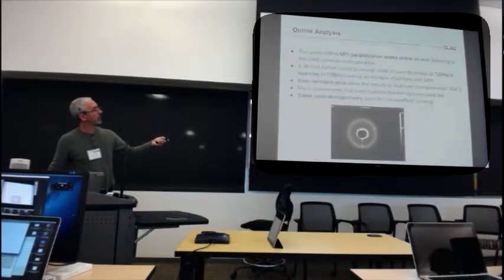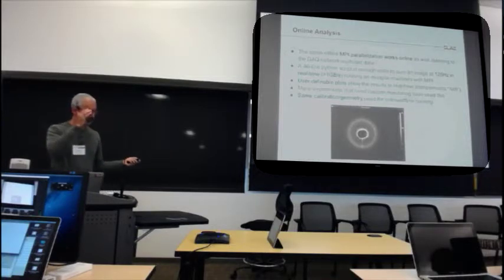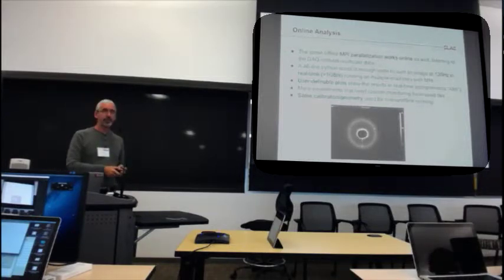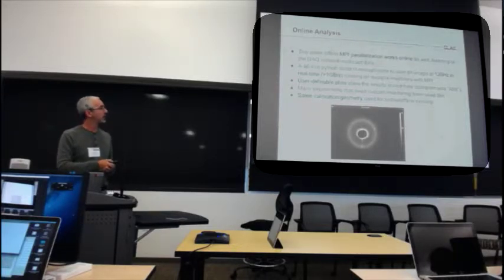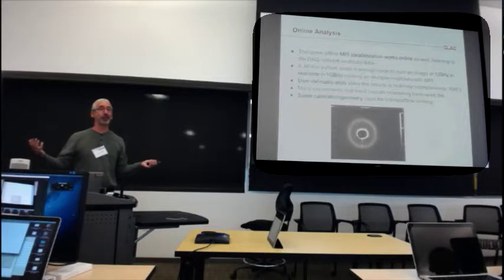Another point is that when you're doing this online monitoring, you can use the Psana calibration and geometry stuff, which is one other thing I'm going to touch on later. A lot of us are solving the same problems, and I don't know how to solve this, it's hard. You can see the frowny face that Tom White put on the slide next to geometry yesterday. You hear about Nick, how they struggle with metrology a lot, and we have our own metrology stuff for Psana. It's a bit of a shame: we've got a hard problem, and we're saying, since it's so hard, let's solve it multiple times.